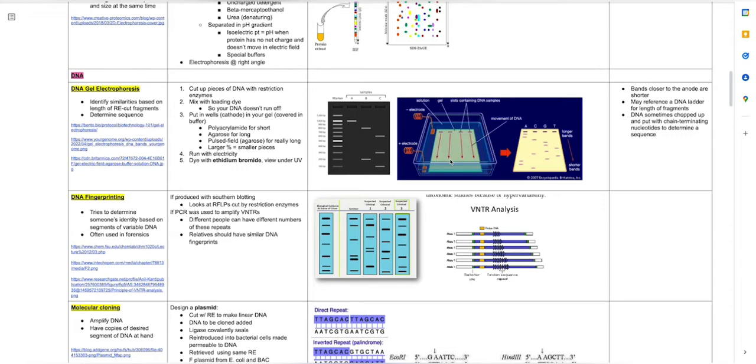because they're able to move a longer distance. And you may also be able to reference a DNA ladder for the length of fragments. So here is a DNA ladder or a marker. Basically each of these pieces represents chunks of DNA that are this long. So you can see based on this ladder where your fragments lie, and that shows you how long they are. If you look at this one, it's pretty much in line with the 600 BP mark, so you can estimate that this one's about 600 base pairs long.